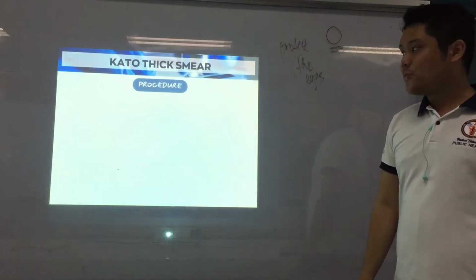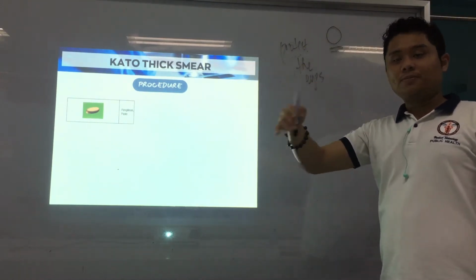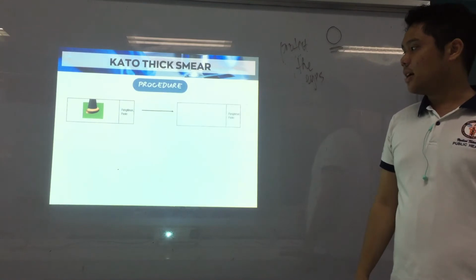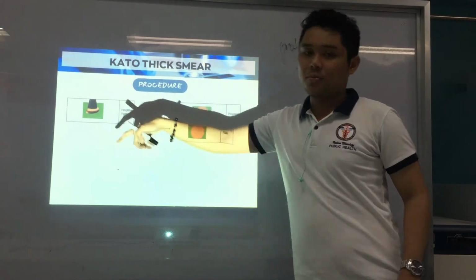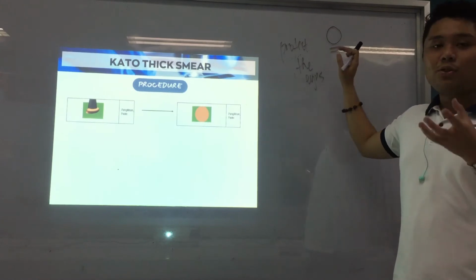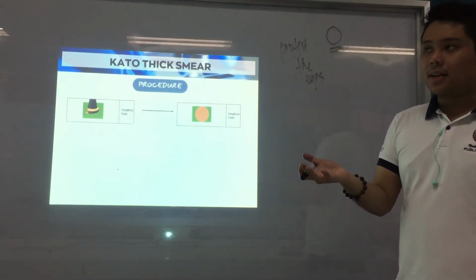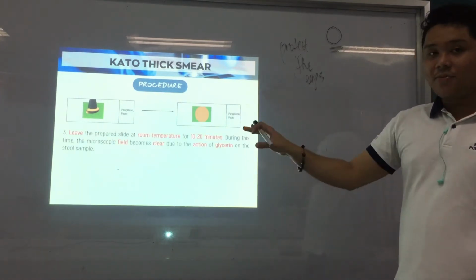So here's again a rough representation of the procedure, diba? Again, the cellophane is covering the stool, alright? We use a rubber stopper and then ayan. So we press until it now forms, ayan. So again, the circumference of the rubber stopper, meaning diri sa ilalom, the rubber stopper, circumference. So if the size again is like this, then we need to achieve this size in our stool, all right? And that's the procedure.